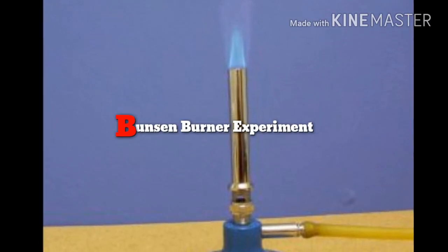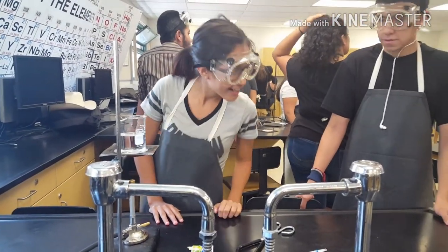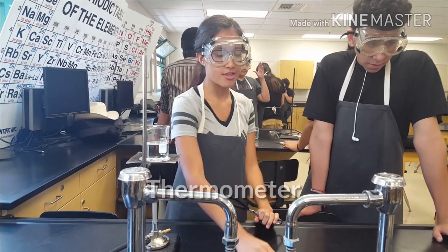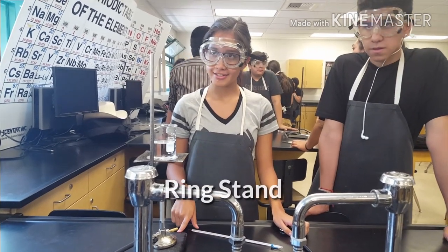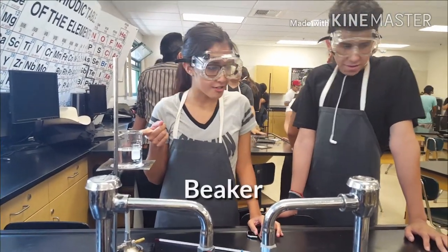Everything is awesome! Hey, let's put on your heating bottle. Tom's good — an extra thermometer, a ring, an iron spring, a beaker.